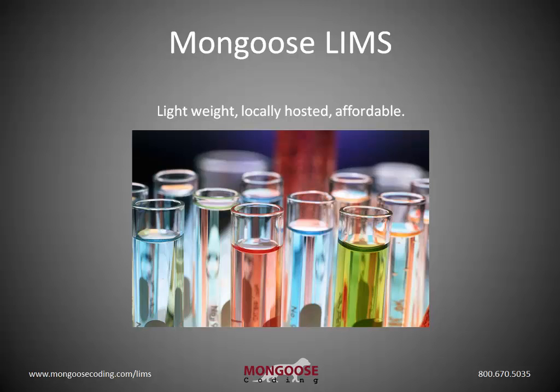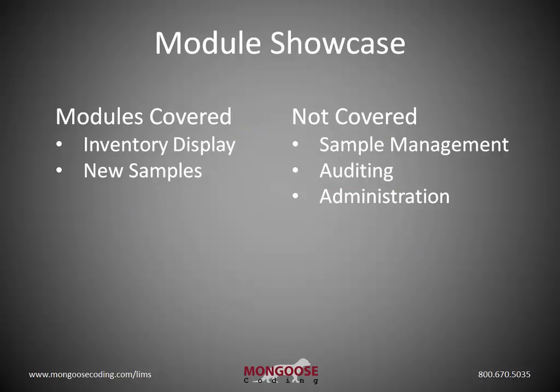Welcome back to Mongoose LIMS. This is the second video in our series, and here we're going to cover two of the five modules included in the base model. These are for moving and displaying inventory, as well as adding new samples.